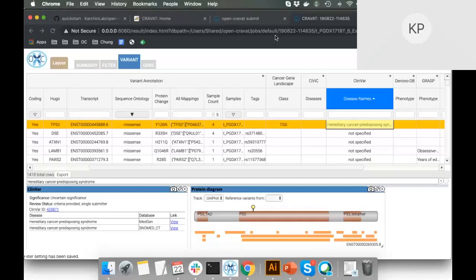But MAF files are kind of not well specified, let's say, for us to incorporate. They can have an indeterminate number of columns. If there's some other input format I'm missing out on, let me know. Okay. And then is this available on BioWolf or Helix? No, no. Okay. And then is it better to run this on an individual computer like a Mac Pro? That is what I am running it on currently, and it has absolutely no problems.